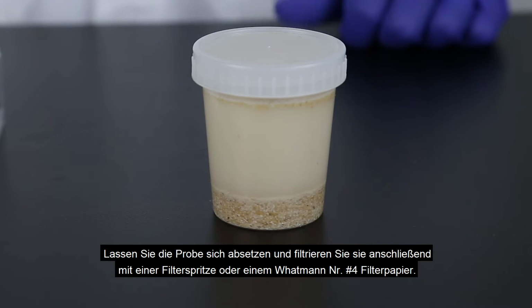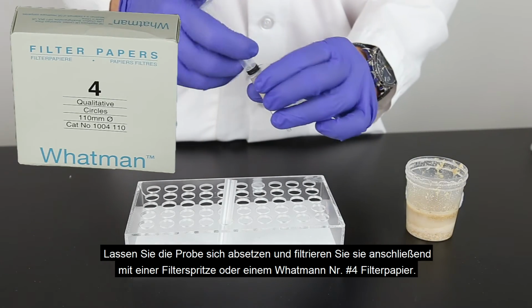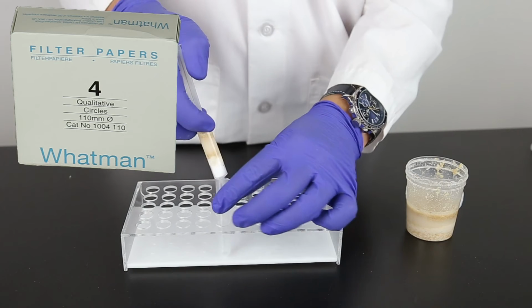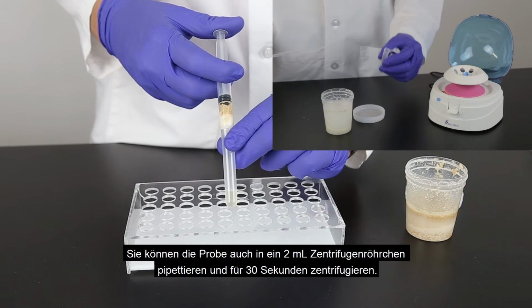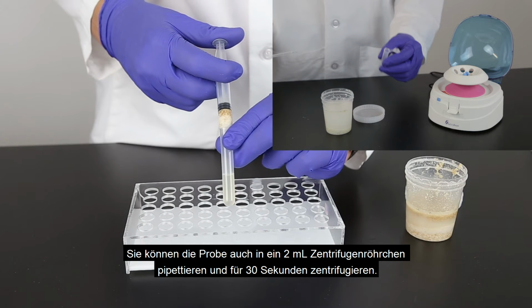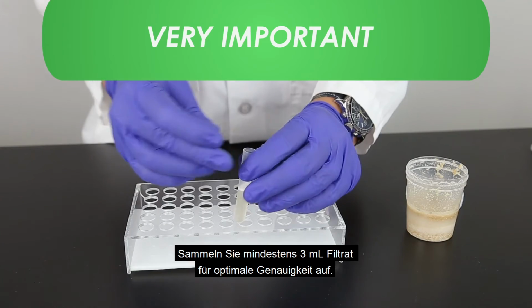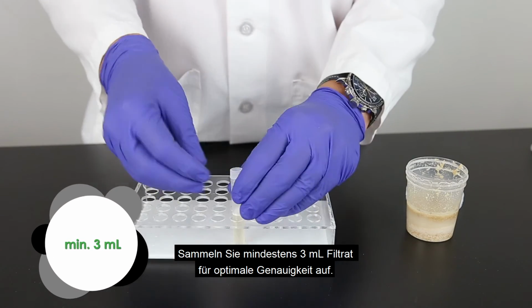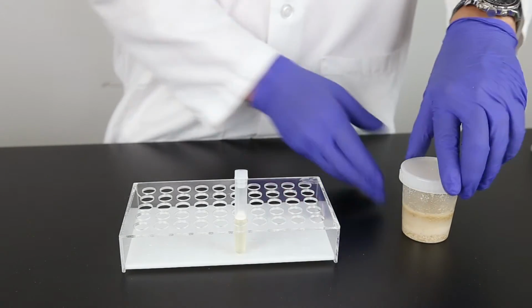Allow sample to settle and filter with a filter syringe or Whatman No. 4 filter paper. You can also pipette the sample into a 2 milliliter microcentrifuge tube and centrifuge for 30 seconds. It is important to collect at least 3 milliliters of filtrate through a single filter syringe for optimal sample accuracy.